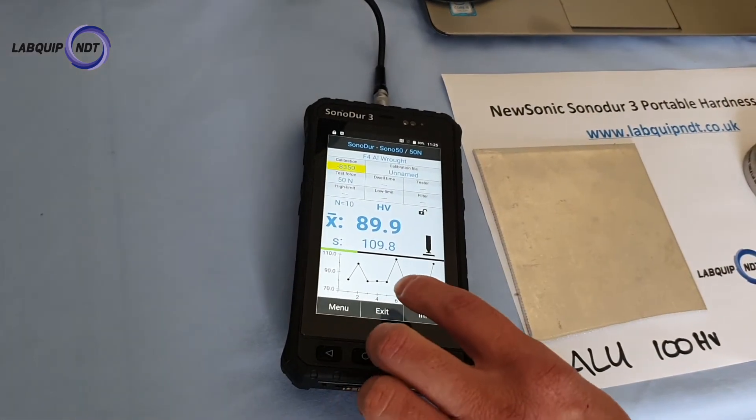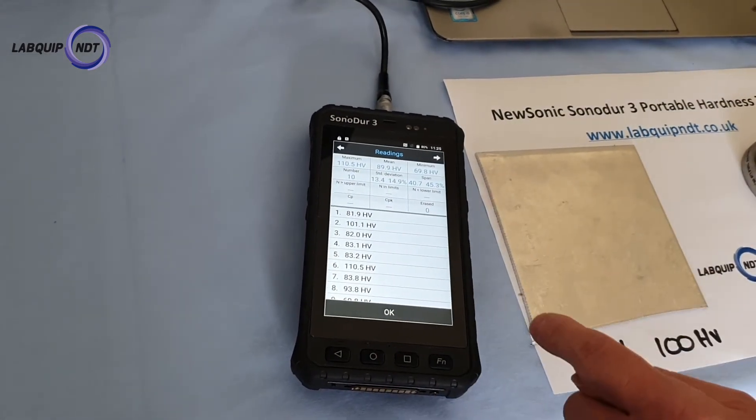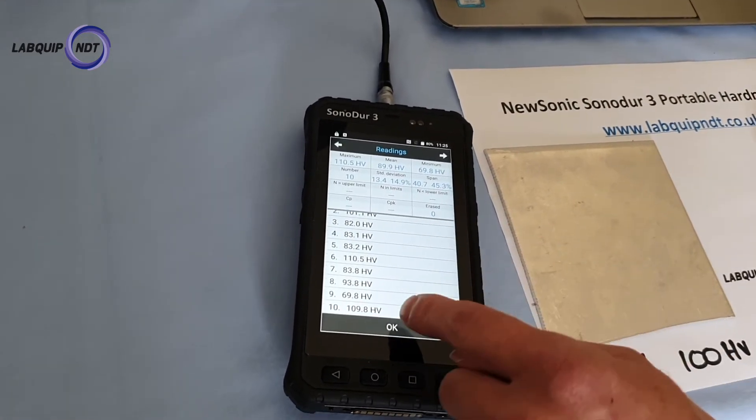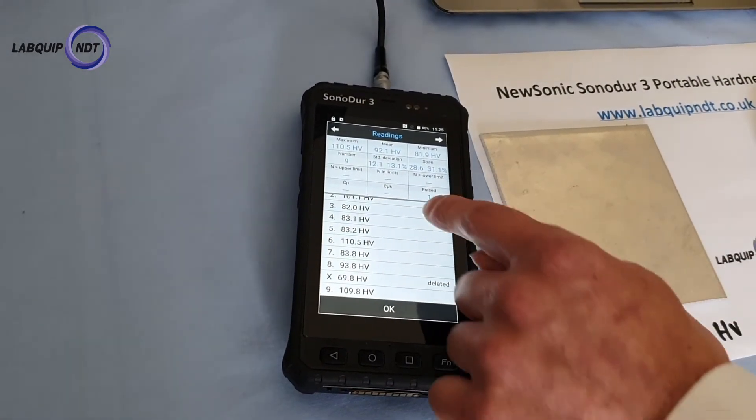It gives really consistent readings. Again we can go in there and check how we're doing on the results. We can delete maybe some that aren't so good and bring that span down.